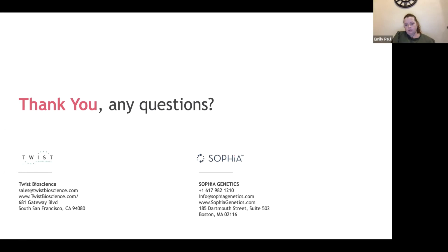Yeah, so we can definitely see the 3 and 4 copy numbers, as we focus really on the germline avenue for this presentation on copy number variations. But we have algorithms that allow our somatic modeling to look at more fine-tuned resolution. So if you have 4.5 copies or 22.5 copies, we're able to actually determine those as well. But here in a germline exome, we really do see 0, 1, 2, 3, and 4 as appropriate. For those of our customers working with HeLa cells, it could be any number of copies. Right. Favorite number, yes, absolutely.